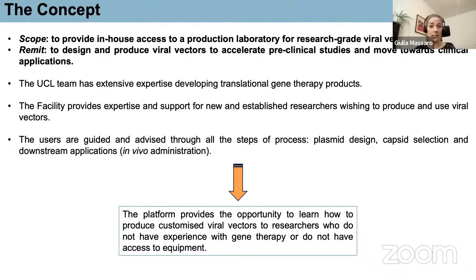How do I inject these preps, these vectors, into animals? What's the dosage, and things like this. So as I said, it's quite a varied user base. And the whole scope is to teach and provide opportunity for various kinds of research, to join the lab and use the facility.